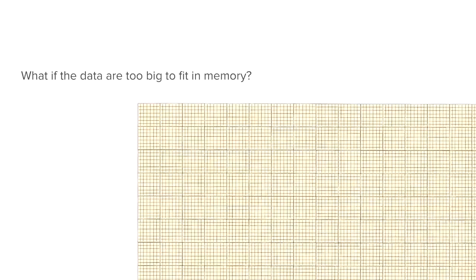So why would you even need Zarr at all to represent something like this? And really Zarr comes into play when you have data that are small like this. This is very easy to load into memory, but Zarr becomes a really big deal when suddenly your data are too big to fit into memory. And so the question is, if you had a plane this big and you need to load this on your computer, there need to be mechanisms that allow you to process this, not all at once.